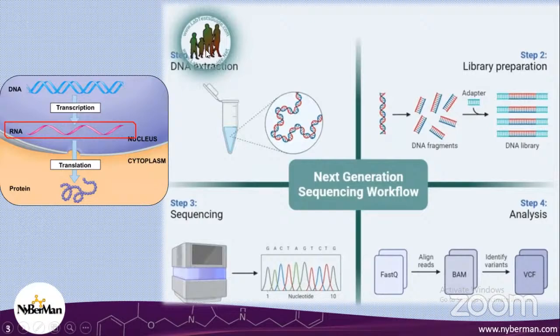The samples come from the concerned patient, and then within the wet laboratory the data preparation will be done. A DNA library will be made, and adapters will be added to your data to stabilize it, because the DNA in our body is in a very active form, so it would not be possible to access the expression values that we are going to analyze.